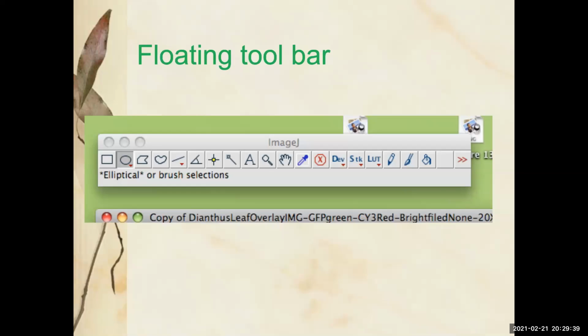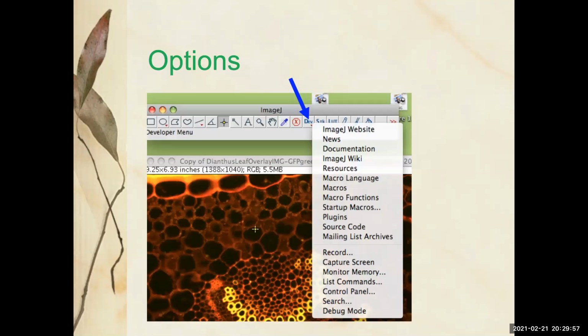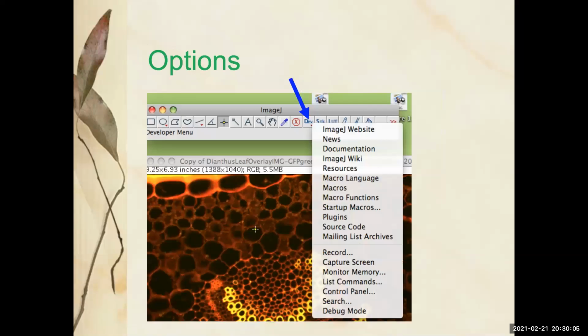Again, over-engineering with a computer, you have the list of things you can do at the very top of your screen when you're using Fiji or ImageJ, and then you have this floating toolbar that usually comes up where you can draw things. It's really a draw-things-on-my-scope kind of toolbar, including text or arrows or things like that. And then it also takes you to macros, or things that people just recorded, or plugins, or basically fancier macros, in my mind anyway.